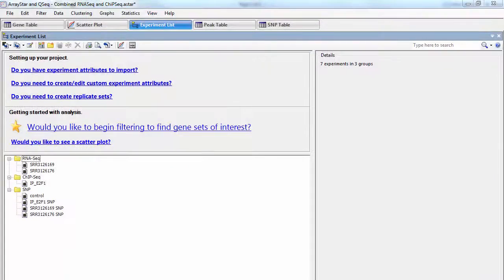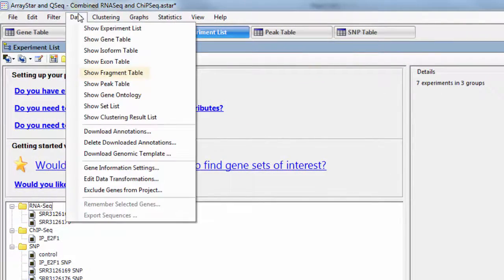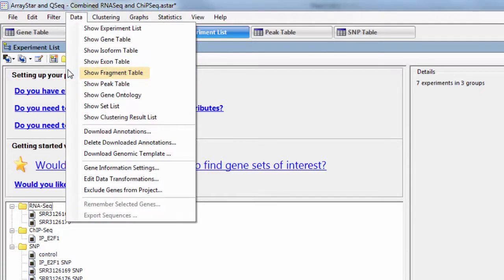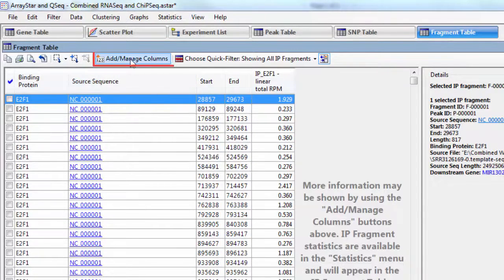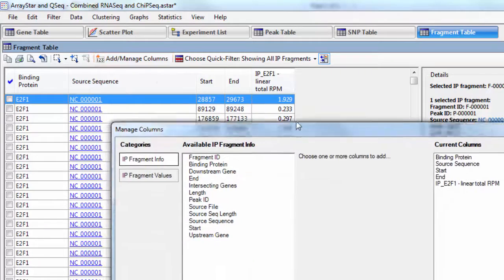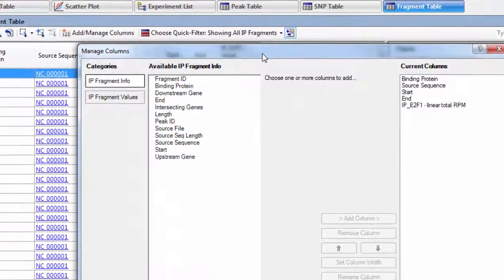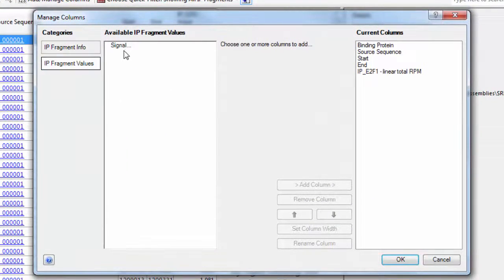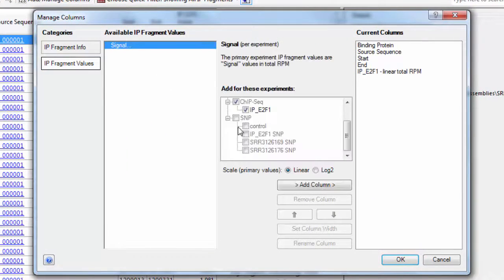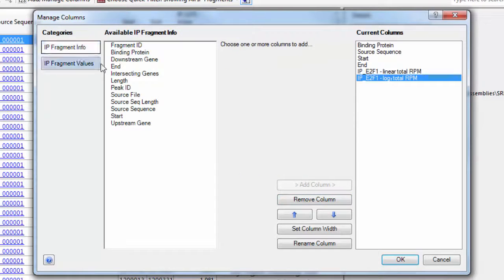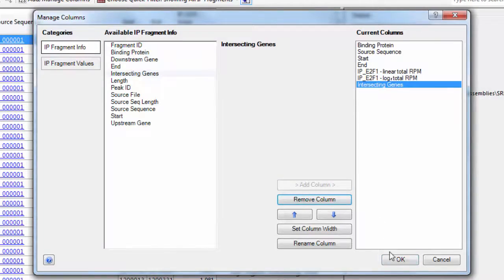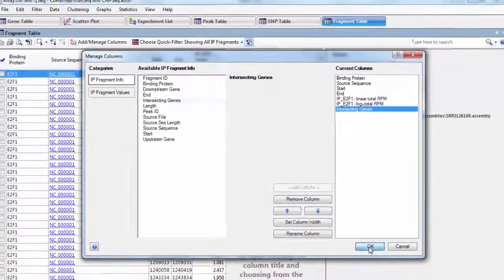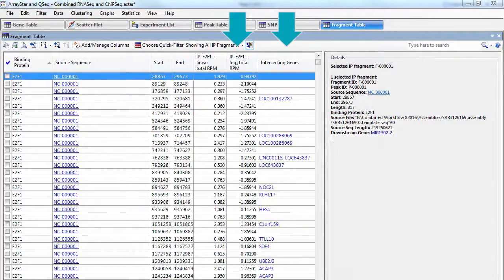So first, I'm going to open the fragment table by going to Data, Show Fragment Table, and then I'll click on Add Manage Columns so that I can add a column showing the Log2 IP signal values, as well as a column that will show genes that intersect the peaks. You can see the two new columns have been added here.